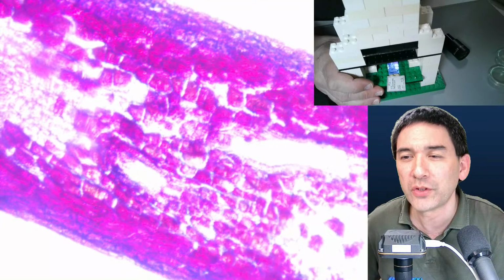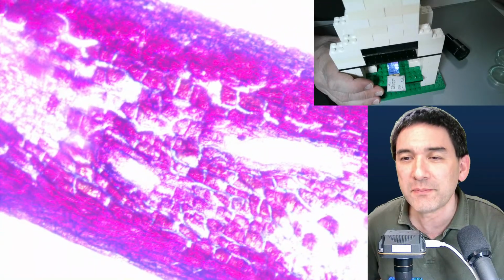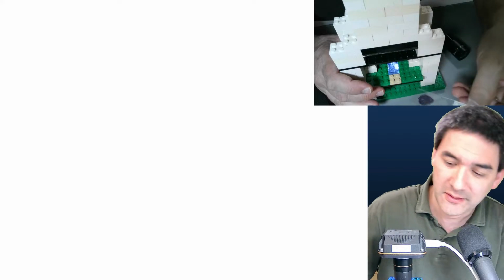I've always wondered what controls the behavior of the microscopic world. What does paramecium look like under it? Now, I do not have... well, I mean, I do have... your request, I will try this now. I don't have paramecium here, but these are other ciliates, and there are a couple of other ciliates on here.